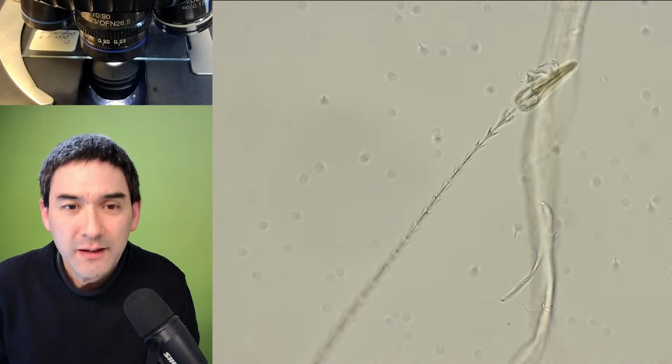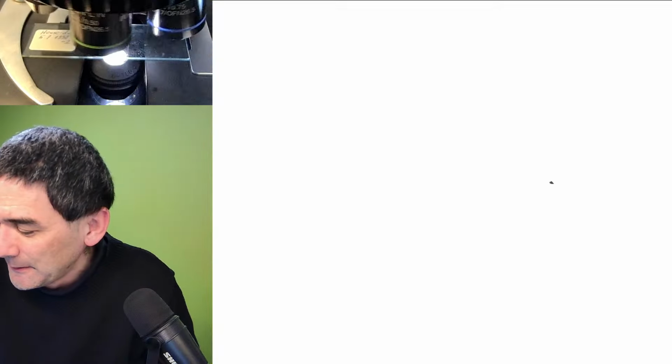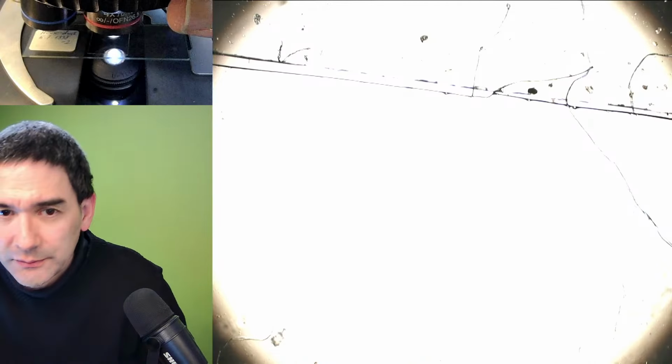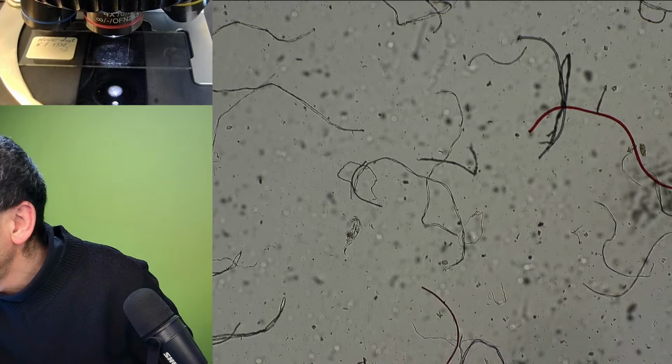So okay, there's another one, another thing I found here. I don't know if I'm able to find that one. Let me see if you're able to identify what it is. Let me go down again. Where's the magnet? Let's go further down. I don't know if I'm able to find it.